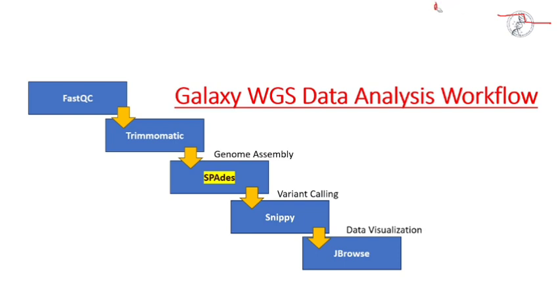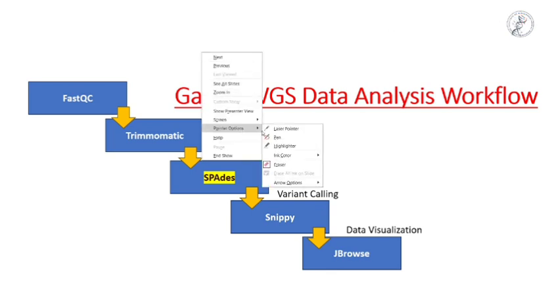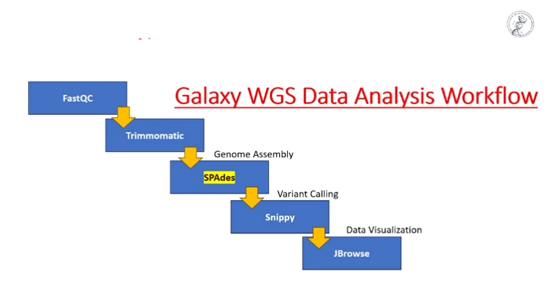We will take an already sequenced genome, using a reference genome of human, which is already sequenced. The human genome sequence has been available since 2003, I think. We have a number of assemblies available in the UCSC Genome Browser. I think the last full genome sequence assembly is from 2013. We saw this when we were taking the gene sequence for primer designing, 2013.